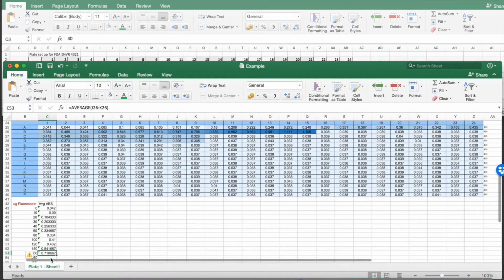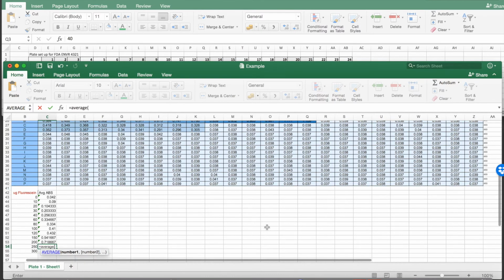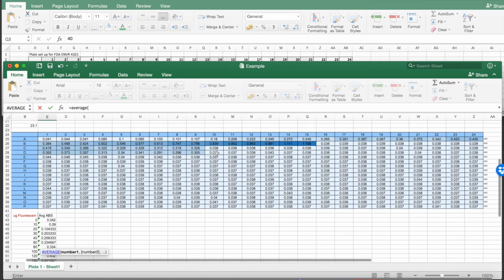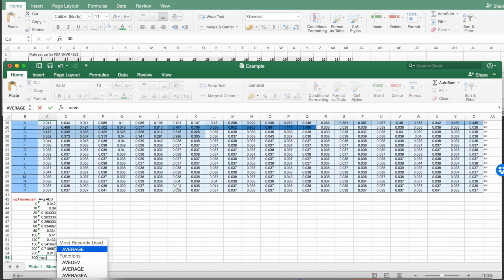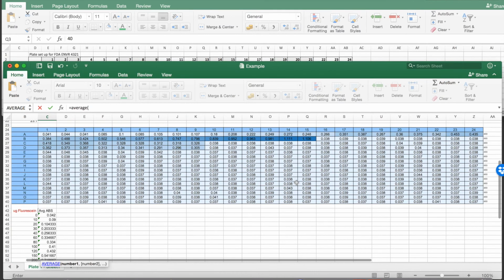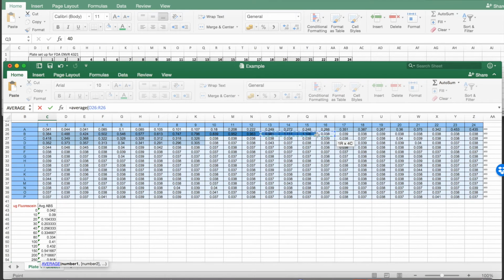During the lab I looked at their data and they did have a pretty good standard curve. They didn't have many pipetting mistakes, and their standard curve was quite linear.